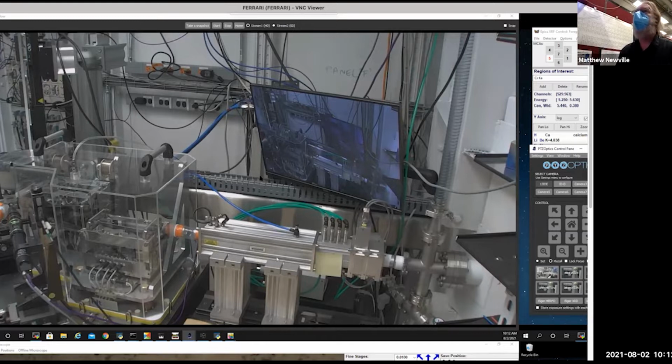And then here, this long rectangular tube is the ion chamber that I think Steve described in his lectures as well. That's just a gas. Here we have this entire volume filled with helium. We're using only helium, that's why it's so long. It's 200 millimeters long. Of helium, the x-rays go in, some of the x-rays get absorbed or Compton scattered by the helium, and that creates a current that we count, and that current is proportional to the energy of the x-ray, but also to the number of x-rays. So we use that to determine what the current hitting the sample is.